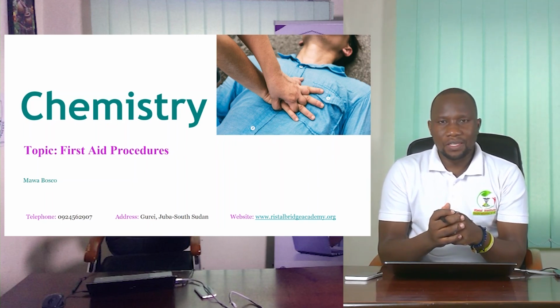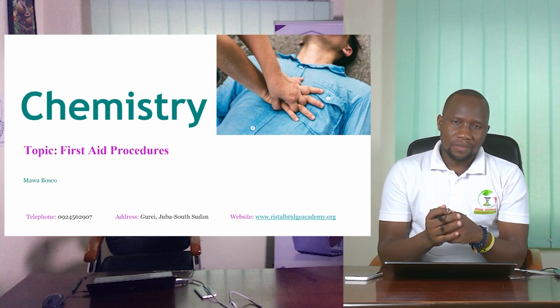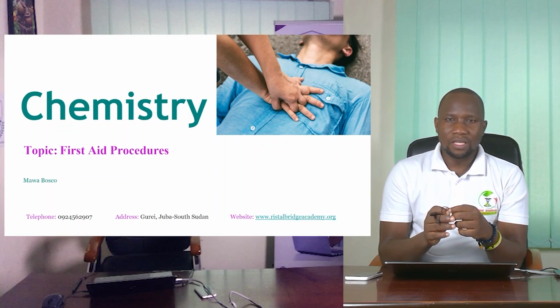First aid procedures. Why are we looking at this? We have realized that in the laboratory, inevitably, you might have an accident.